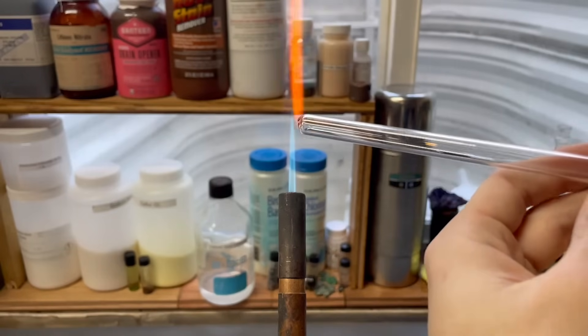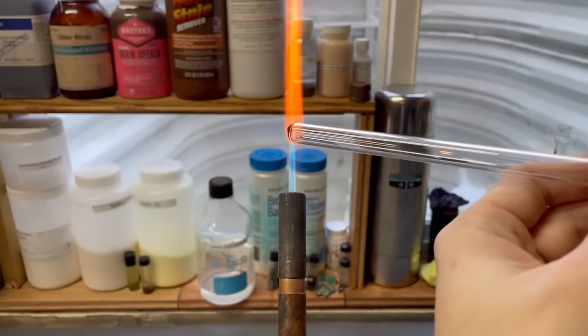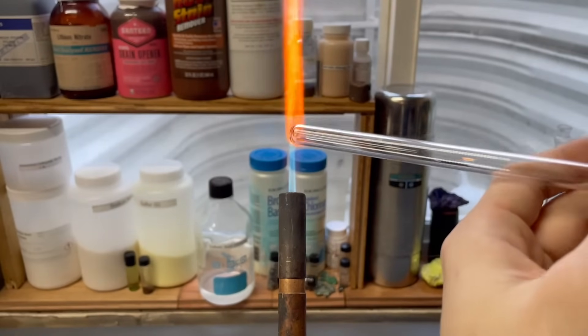Now that we've got most of the glass removed, we're going to melt it down until we get a nice hot tip and then add air into it to cause it to bulge out.